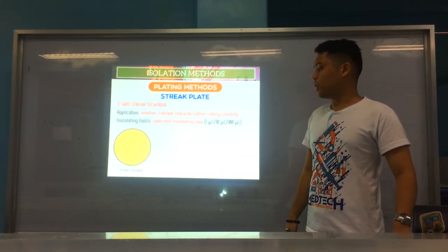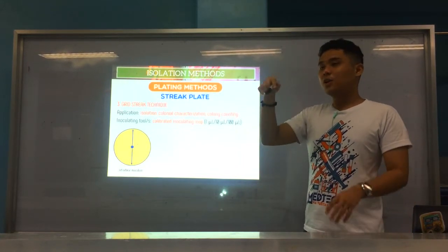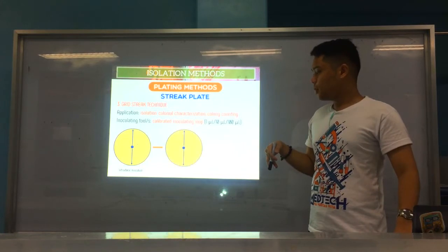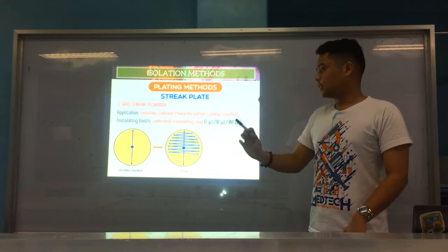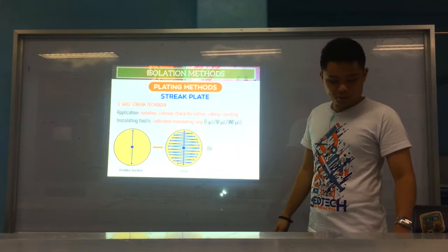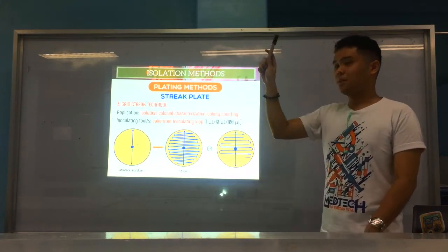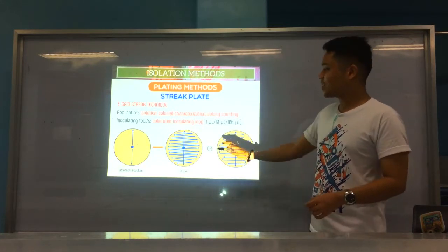So for grid streak, what you do is introduce the inoculum. But instead of, as in multiple overlap, up and down, left and right, in grid streak it is up and down only, and then after that, you streak. Alright, that's grid streak. Okay? Alright, until the end. Okay. Alright, and it can also be individual streaking. Alright. That's grid streak.